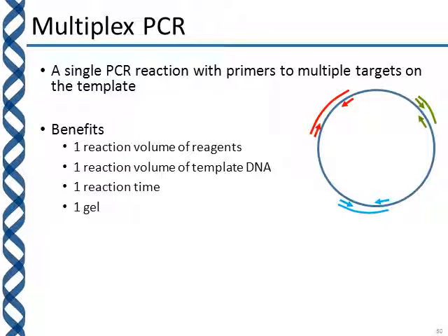When DNA is extracted from clinical samples or patient biopsies, anything like that, where you're working with very limited quantities of DNA, you want to minimize the number of reactions that you run and reduce those down to a minimum, and multiplex reactions can definitely help with that. You have one reaction time, so you don't need to run the red reaction and then later run the green reaction and then the blue reaction again, and you can run these all out on the same gel.